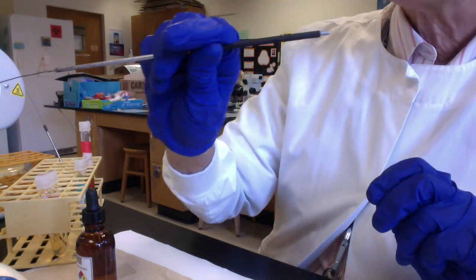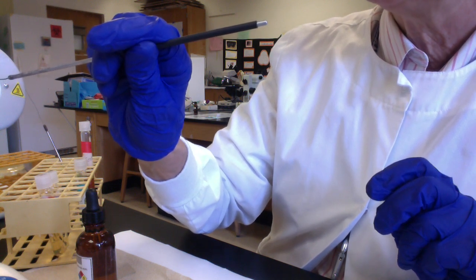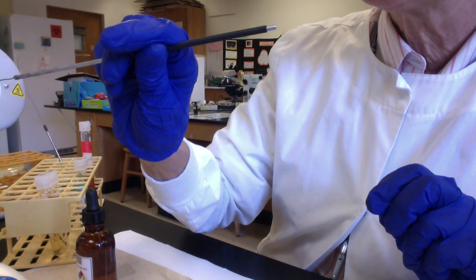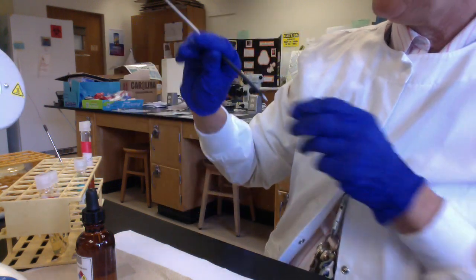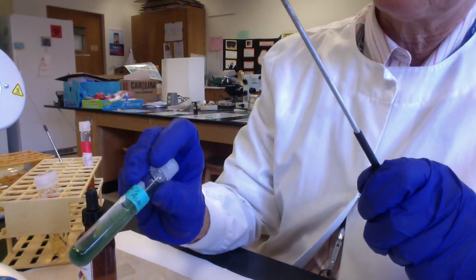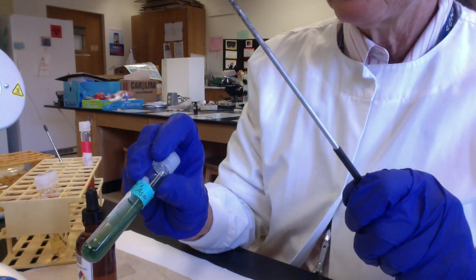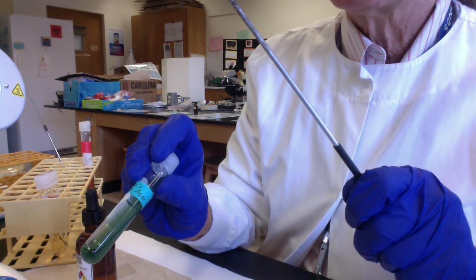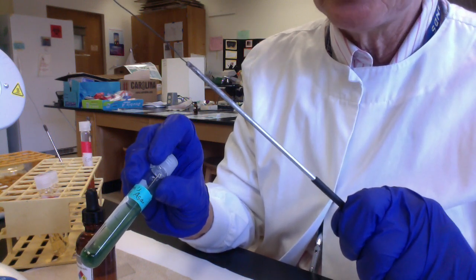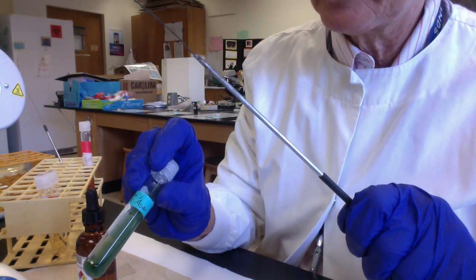Okay, folks, the last test of our MViC test, the C is for citrate, and this is a test to see if our microbes can use citrate as a sole source of carbon and energy. Okay. And the citrate test we use, folks, is this beautiful Simmons citrate agar. It has this really cool pH indicator called bromothymol blue. Bromothymol blue will turn this beautiful, beautiful deep blue color, kind of like Levi's jeans. Sometimes it's called Prussian blue if citrate is the sole source of carbon and energy.